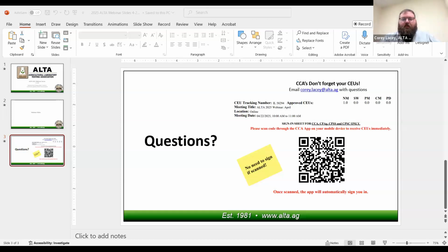Jessica, we have some really, oh, sorry, Bob, go ahead real fast. I was just going to say, I'm now averaging 2 questions a week about this very subject from the client side. And in fact, I was just doing an email this morning with a colleague back in Nebraska about this. I've got to say this: if you do the back of the napkin calculations on measurement uncertainty based on RSDs of 5 or 6%, this carbon market will dry up like a drought. I mean, it will disappear. But if we can get this precision down on the lab side, under 3%, I think we can find quantifiable information that has dollar value. And I'll leave it at that.